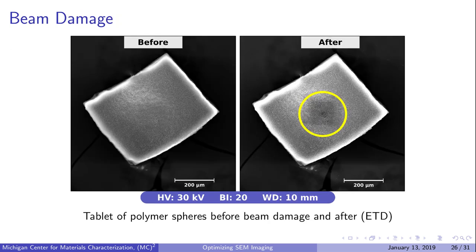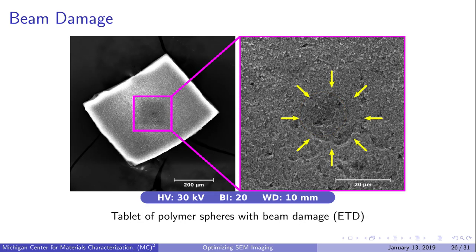Here is an example of beam damage on a tablet of polymer spheres. The before and after pictures show beam damage as a crater in the center of the tablet, and zooming in we can see the crater more clearly.